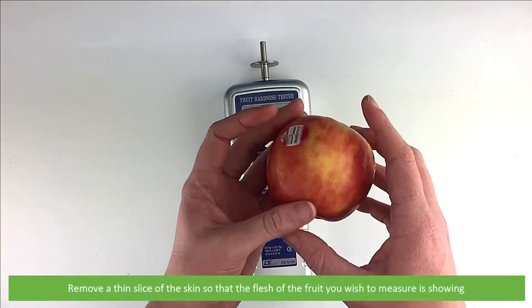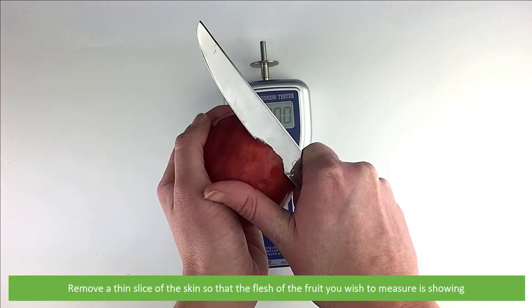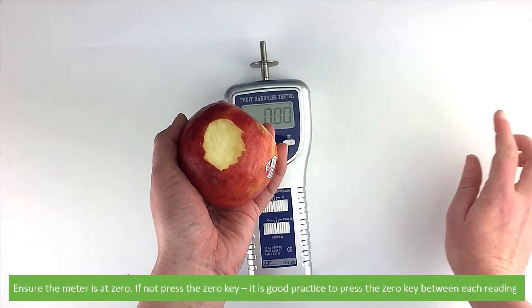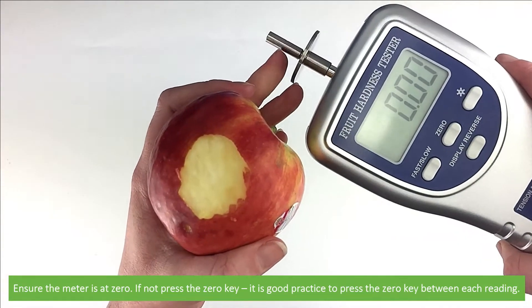Then remove a thin slice of the skin so that the flesh of the fruit you wish to measure is showing. Ensure the meter is at zero — if not at zero, press the zero key. It's good practice to press the zero key between each reading.